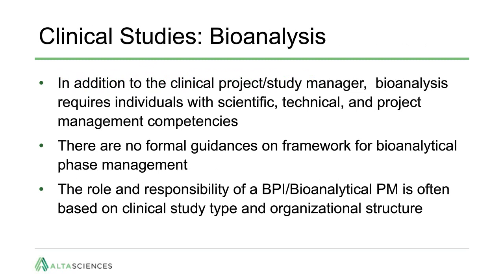So we will now move on to clinical studies and bioanalysis. For clinical studies, in addition to the clinical project manager and many other contributors, bioanalysis requires individuals with scientific, technical, and project management competencies. There is no formal framework for bioanalytical phase management. The assigned role and responsibilities of the bioanalytical project scientist may be based on the clinical study type and organizational structure. So assumptions should not be made when working with a new organization, and it is suggested to obtain clarity on roles and responsibilities.